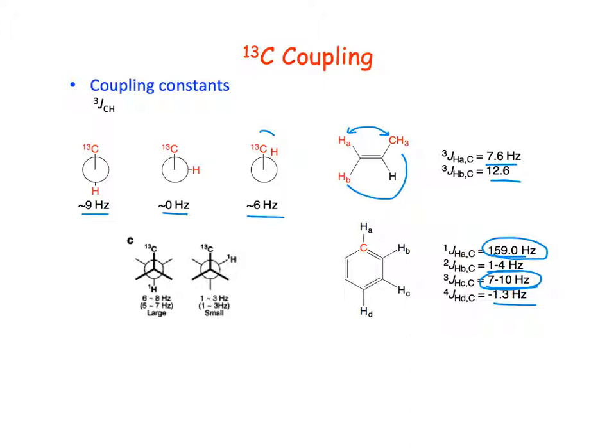Okay, so the 3-bond couplings are especially good for things like this when we look at two-dimensional. If we want to see coupling between a carbon there with another carbon over here, and let's say that this carbon here is a quaternary carbon, then if we're just looking at proton couplings, we can't see past that quaternary carbon because there's no protons on it.